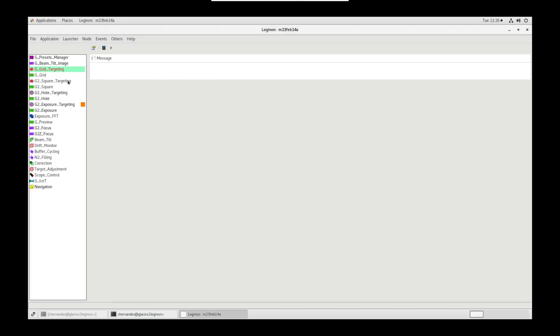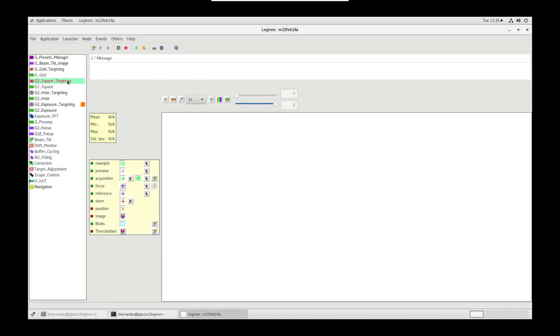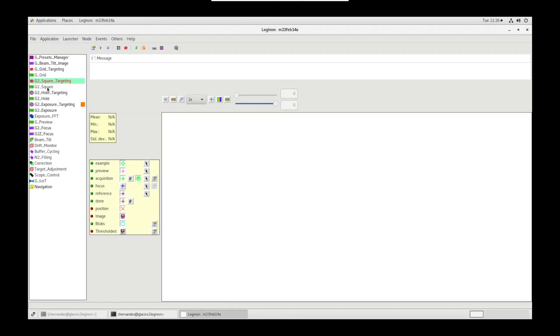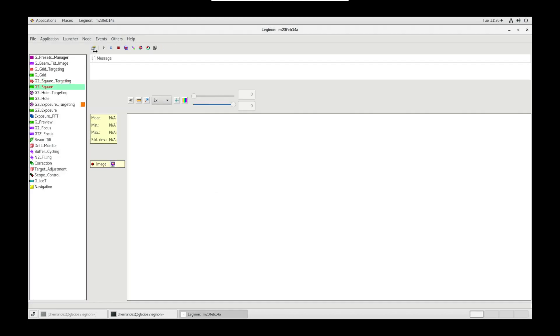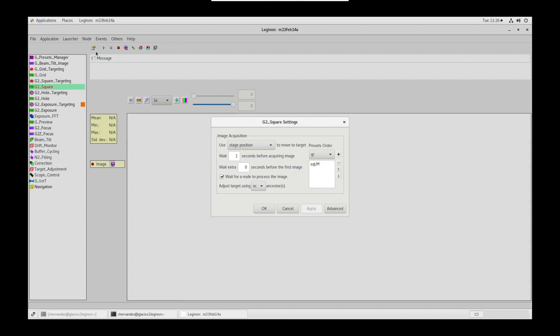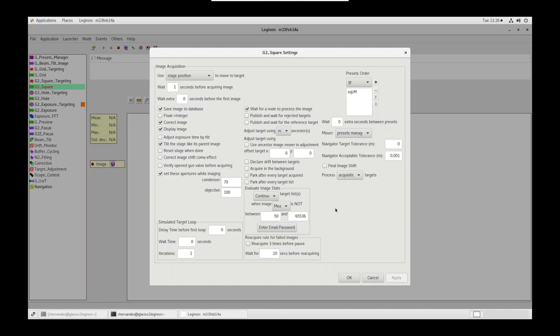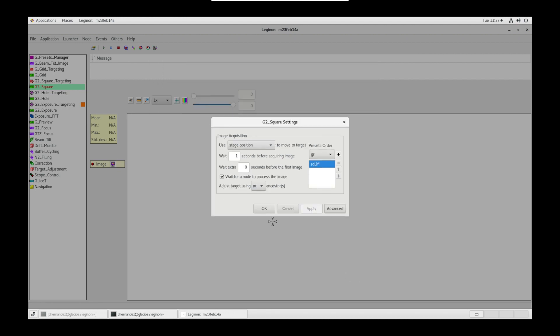Click OK. Then, in square targeting node settings, make sure sort targets by shortest path and enable auto-targeting are selected. Next, in square node, go into settings. Wait for a node to process the image should be checked. Preset should be set to square LM. And in advanced, set these apertures while imaging should be checked with these values.